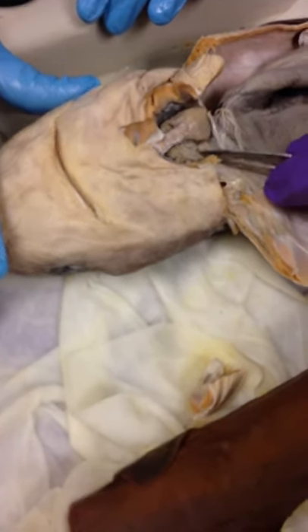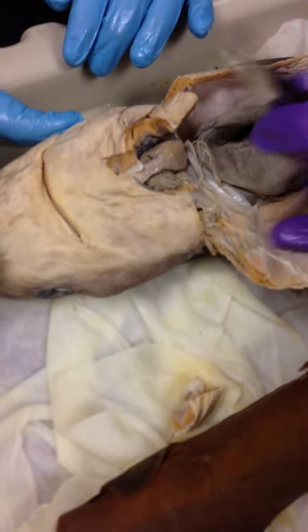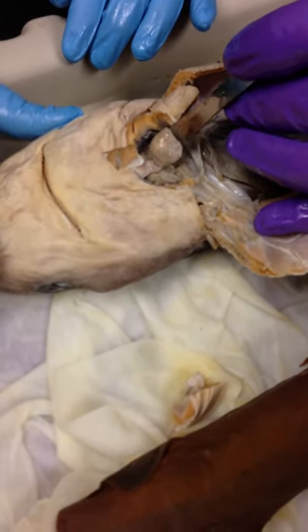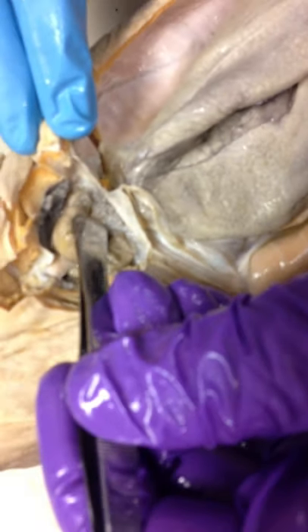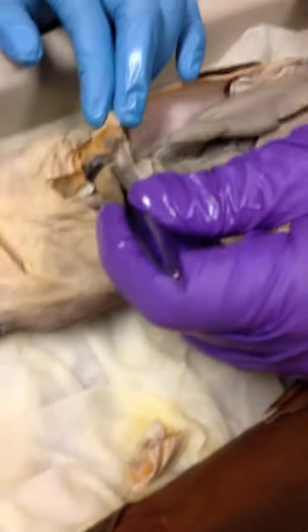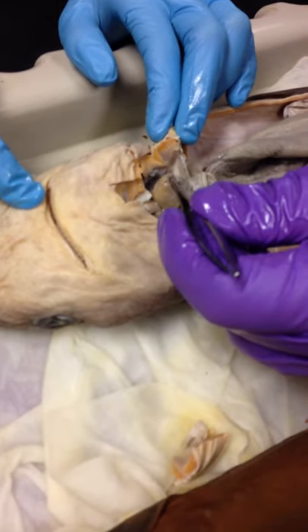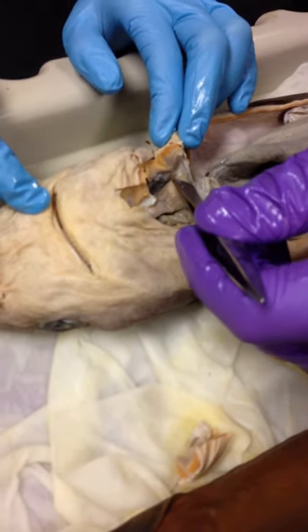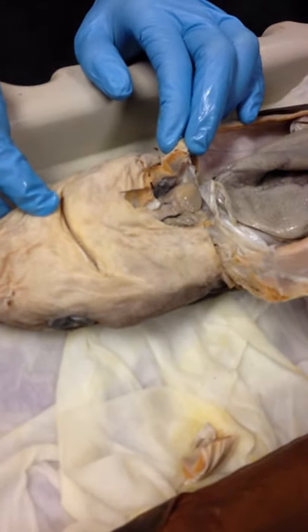This cushy part to the left and right of the ventricle is referred to as the atrium. And then if I pick up the ventricle and push it forward, if you're sitting where I am, you can see a really cool view of a triangular membranous structure right here. And that's called the sinus venosus. So the blood comes in to the sinus venosus, then goes to the atrium, then to the ventricle, and then to the conus arteriosus, and then to the ventral aorta and gills and all sorts of fun stuff.